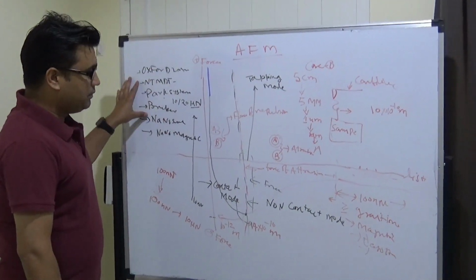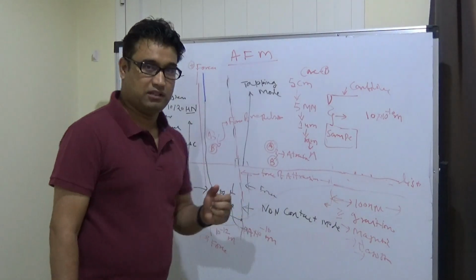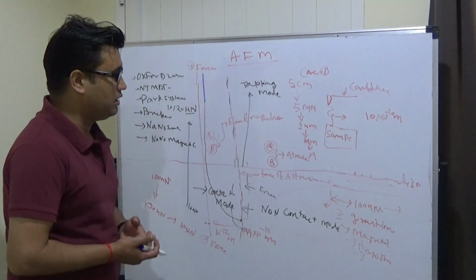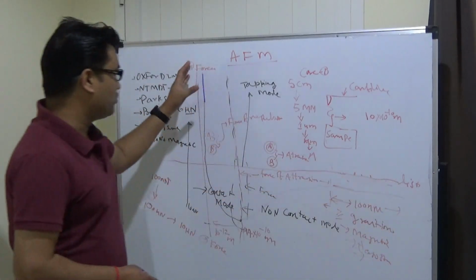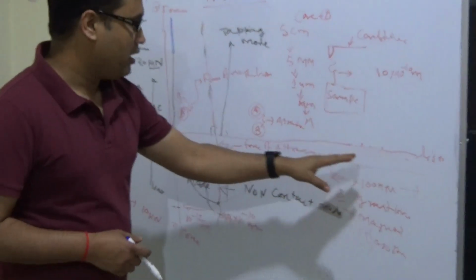We discussed in the previous video how AFM works above the Lennard-Jones potential. So it's just an overview so we can talk about it in the next step, and there's no problem understanding them. The last video talked about the relationship between distance and force. So we are also talking about distance, when the distance between two items starts to get shorter.